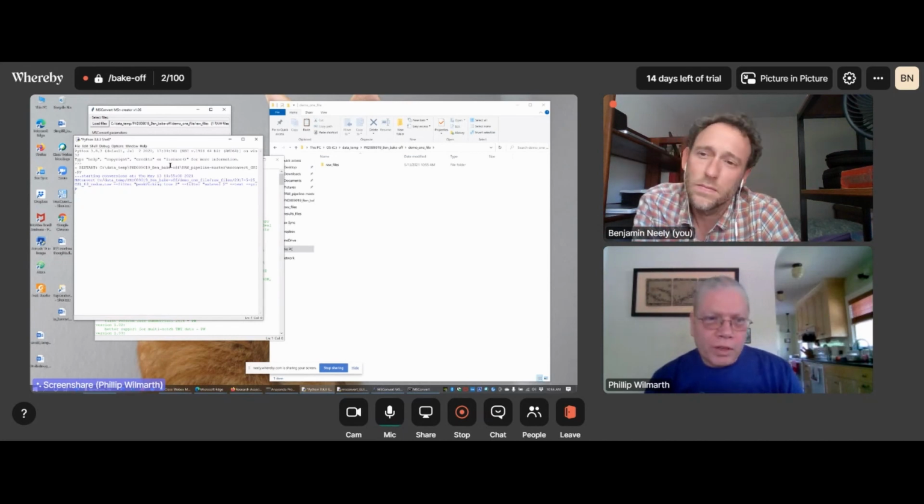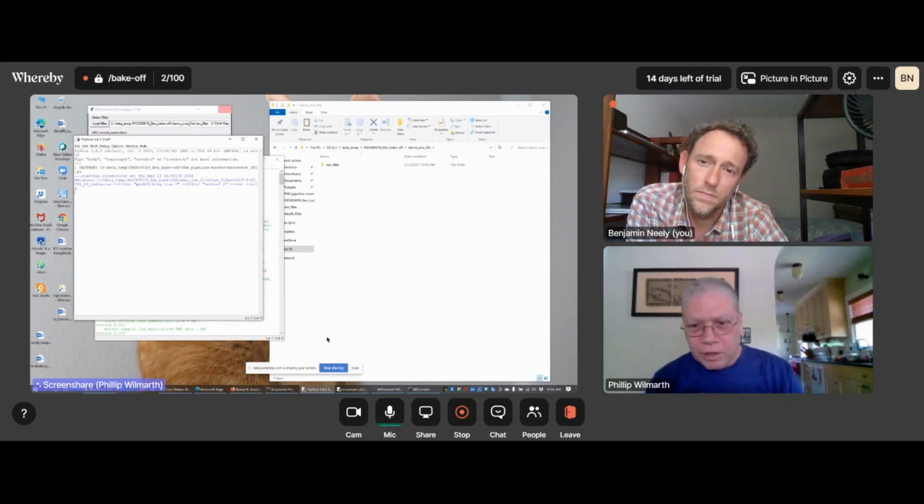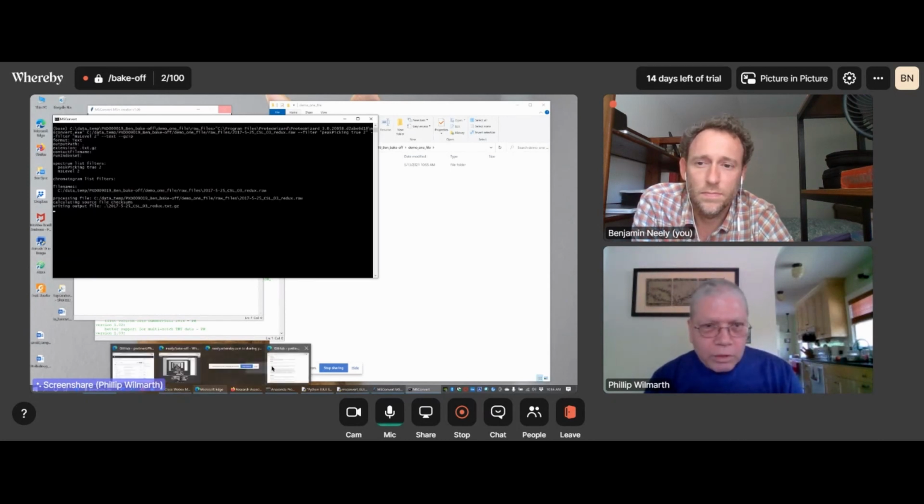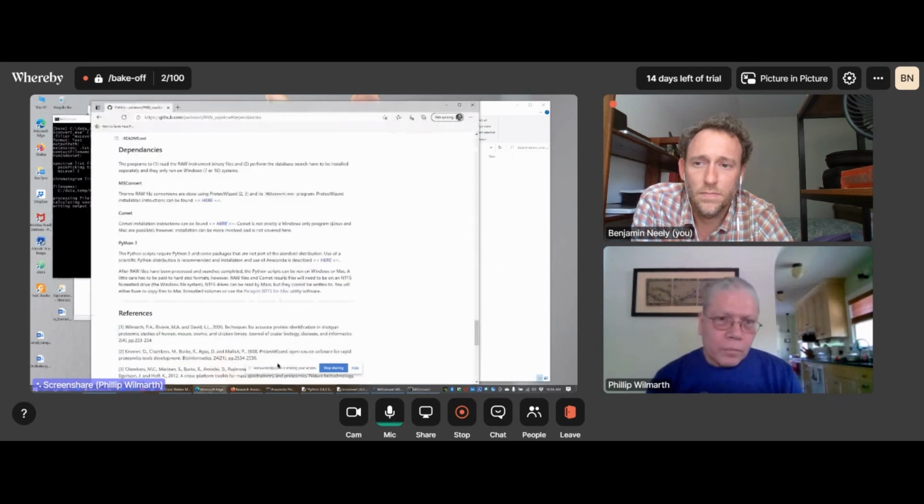And this says we've launched an MS Convert call. And we also see that we've now got an MS Convert process running. We can open that Windows command up and look at the progress. This will take a couple of minutes to run. While we're doing that, let's get back over to GitHub.